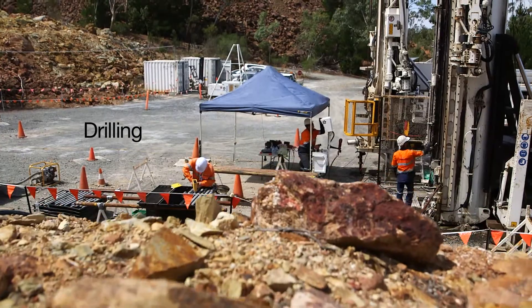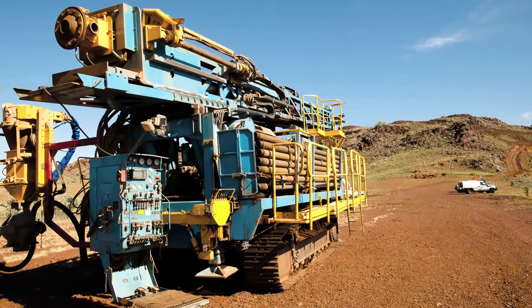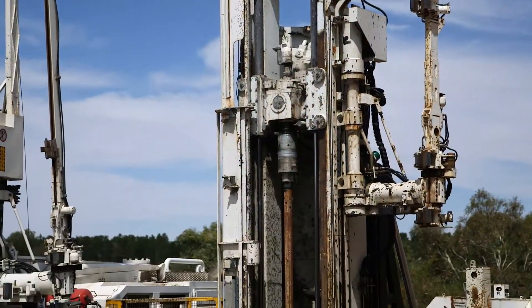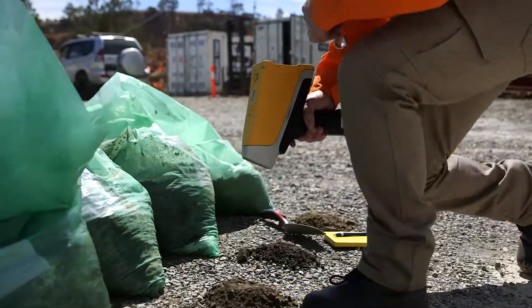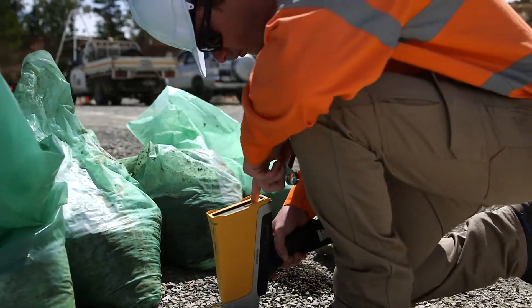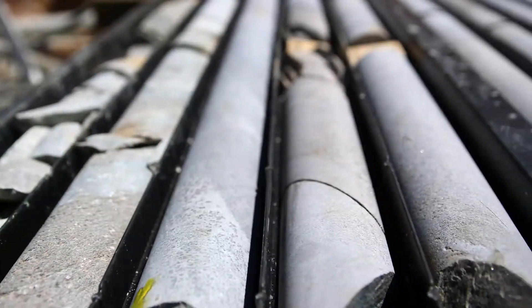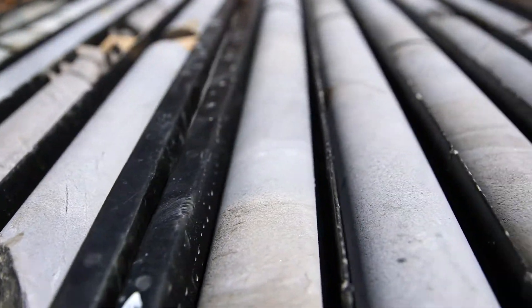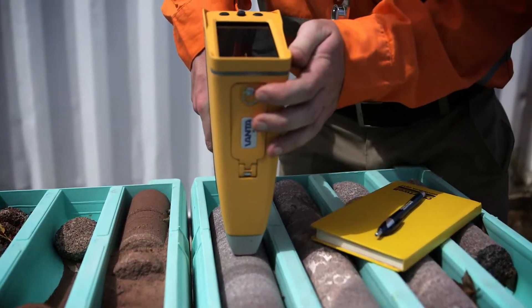Another area where portable XRF is used is during the drilling phase. From an RC drill rig, you get a sample return — a drill chip sample and some fines out of a cyclone. Customers are using the field portable XRF on both of these, potentially using the average function onboard the analyzer to get an idea of pathfinders or heat values, as they call them in the field, to make decisions to keep drilling or stop drilling.